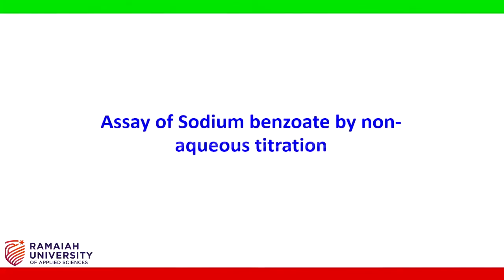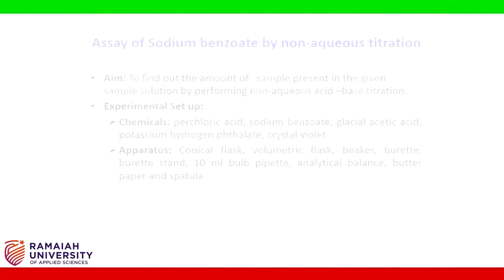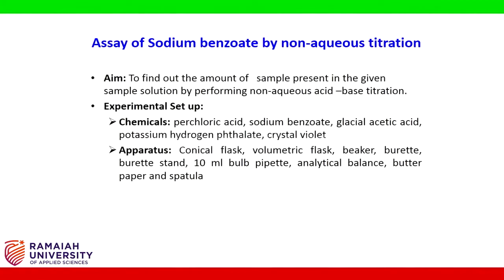Assay of sodium benzoate by non-aqueous titration. Aim: to find out the amount of sodium benzoate present in the given sample solution by performing non-aqueous acid-base titration.